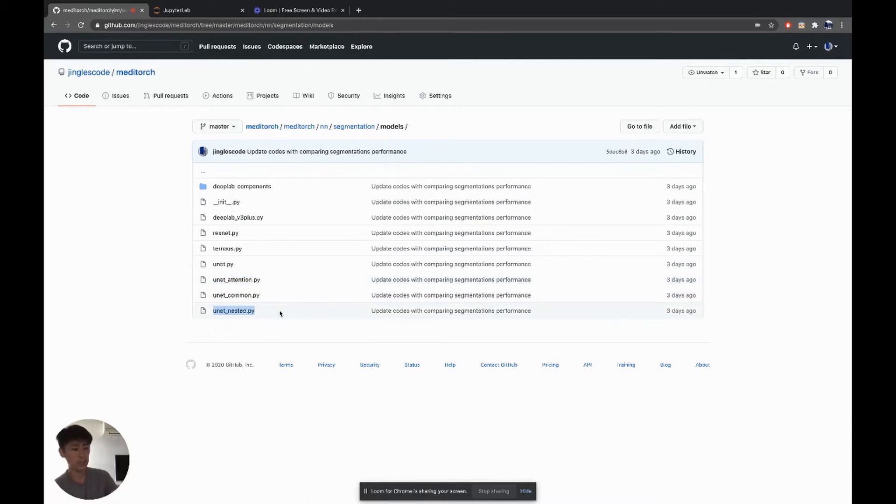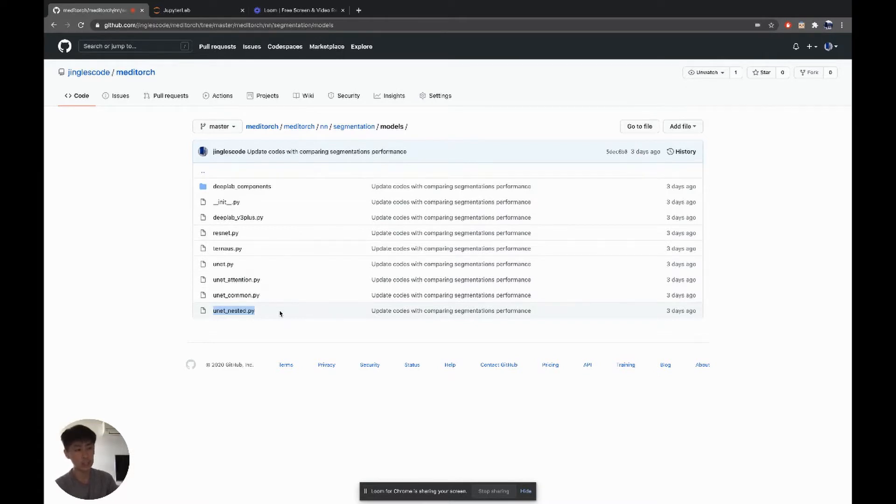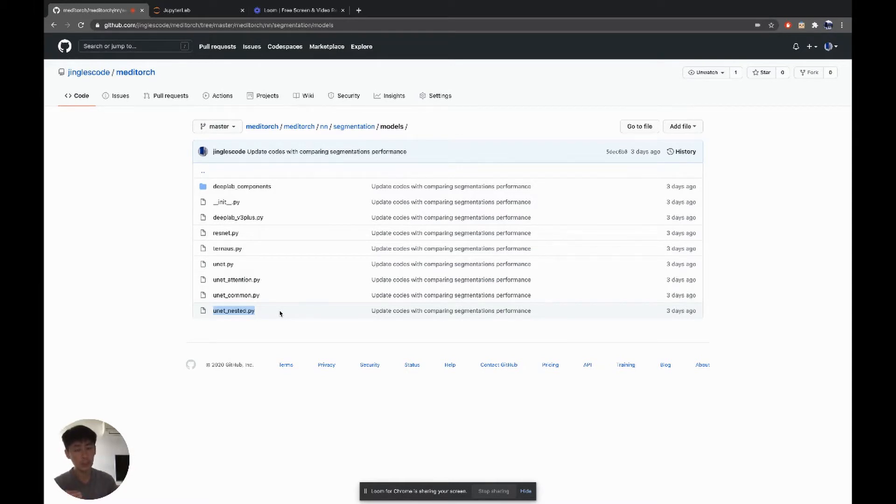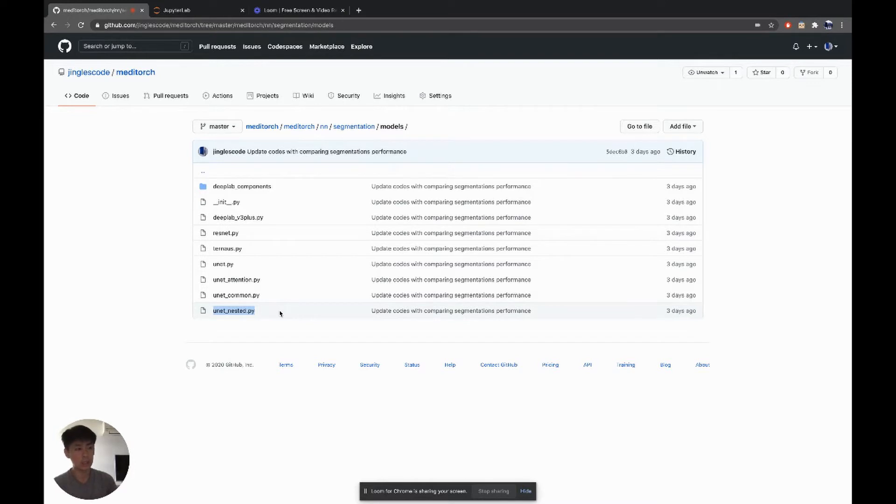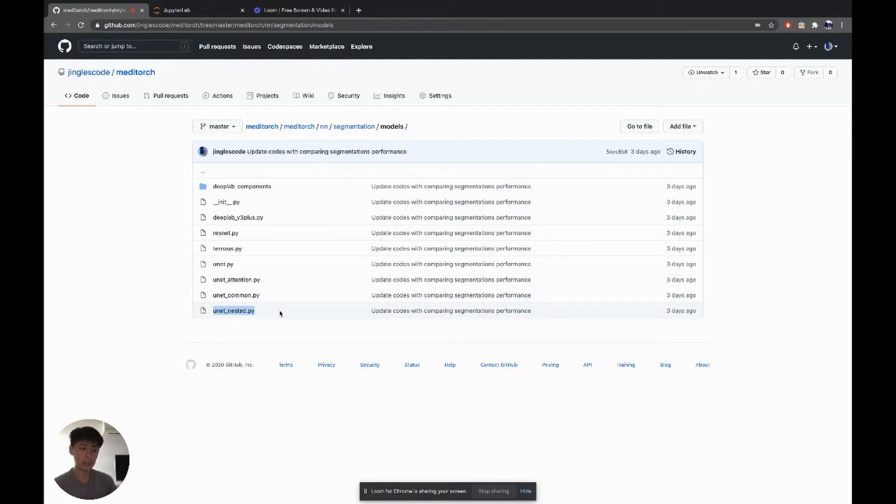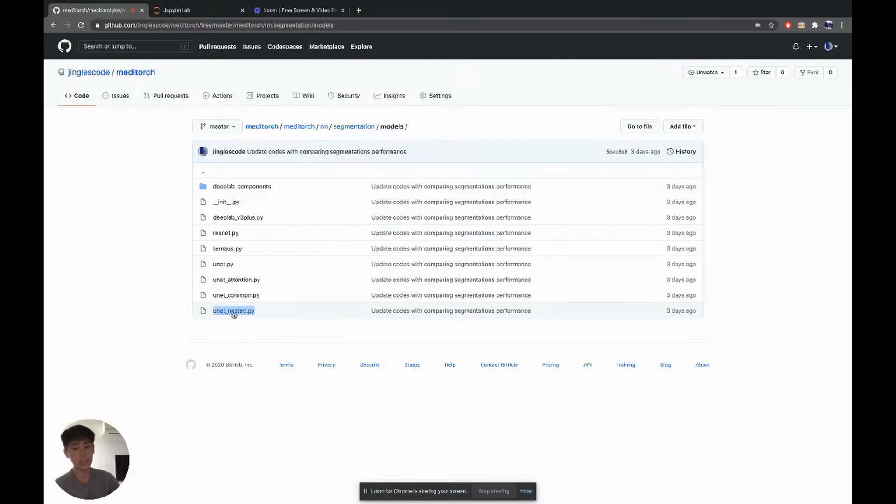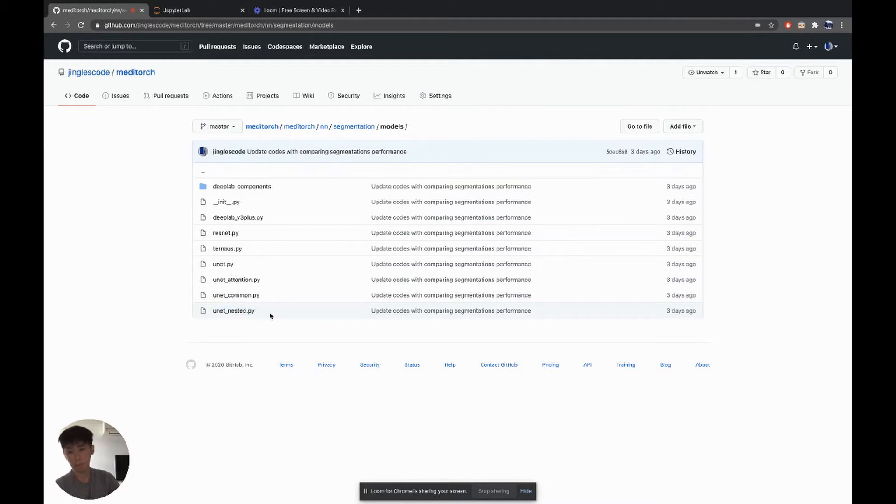Nested U-Net. The selling point is this dense skip connections that helps to make feature maps more similar between the encoder and decoder so that the learning is easier. It can converge faster or easier and thus have better performance. So this is the third U-Net-like architecture that I'm exploring here.